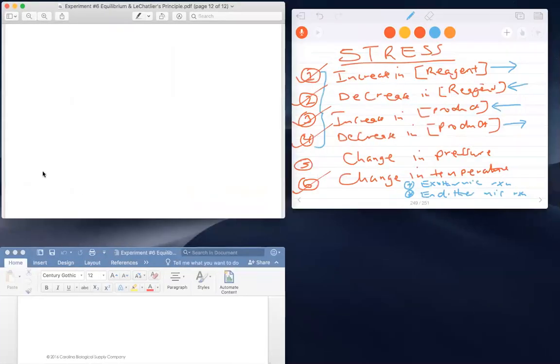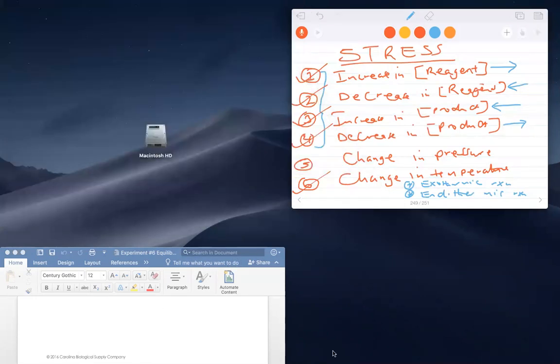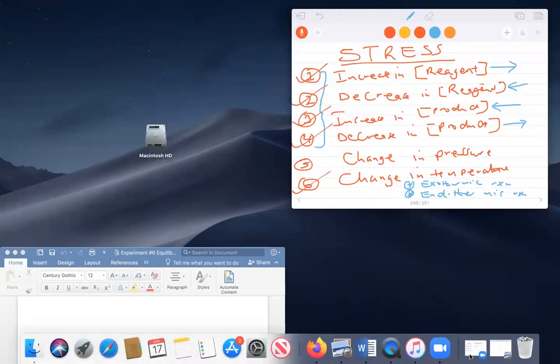I believe this is the data sheet. I should have shown you the data sheet on the lab procedure, on what you will be doing, or the thermodynamic equation for cobalt. All right, for cobalt 2 chloride.